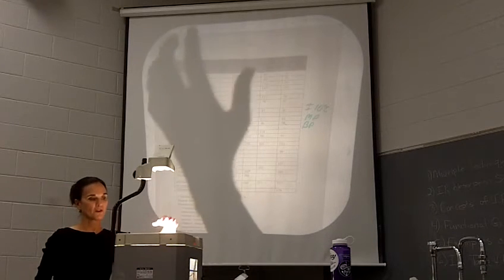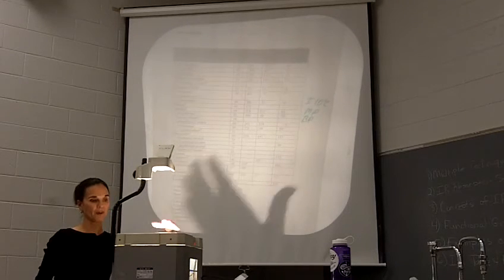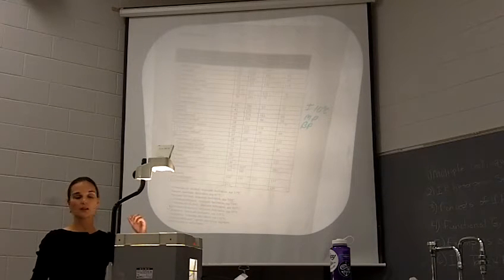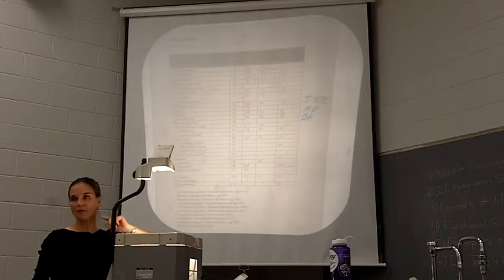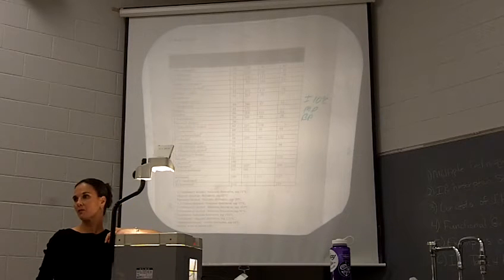So it's first divided by functional group, and then it's in order of melting point and boiling point of those unknowns. And what you want to do is look plus or minus 10 degrees of your melting point and your boiling point at all those possible compounds, because those are the possible compounds for what your unknown could be, okay?